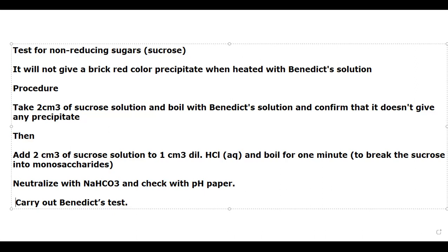Benedict's solution will not give any precipitate if the medium is acidic. So after boiling, after breaking the sucrose into monosaccharides, we need to neutralize that.